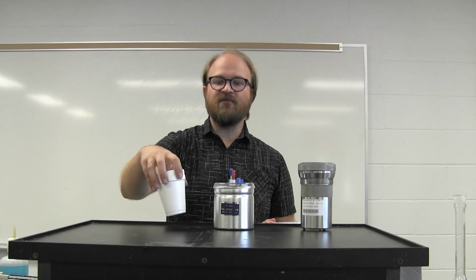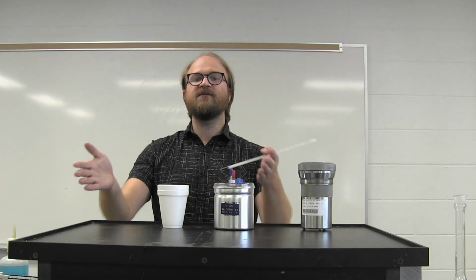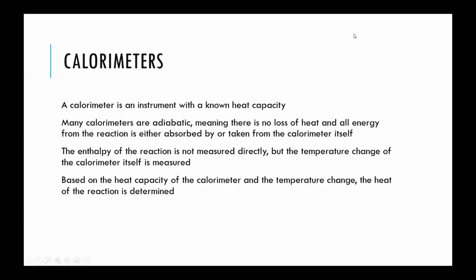Based on the material of construction, styrofoam, there is very little heat that is transferred into the styrofoam itself, and therefore very little heat is lost to the surroundings. Calorimeters are devices that measure the heat energy or enthalpy of a reaction or a process.